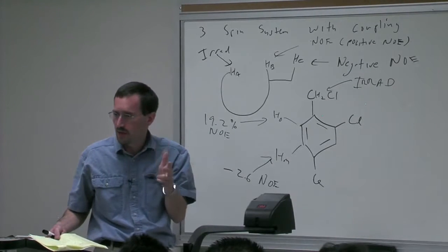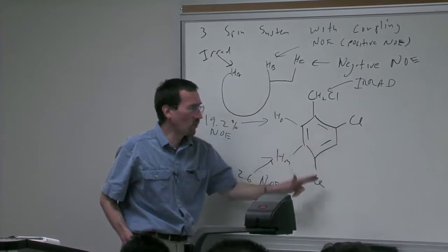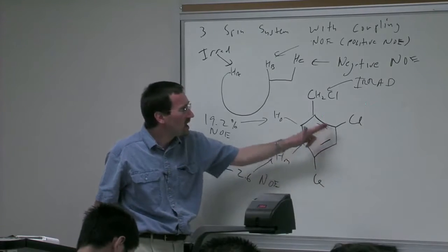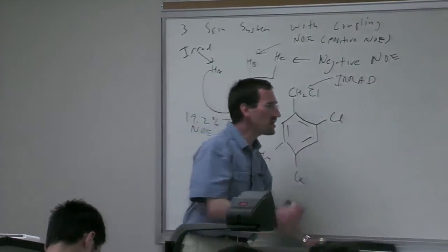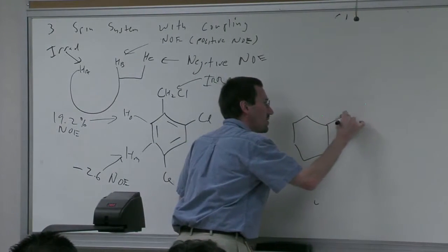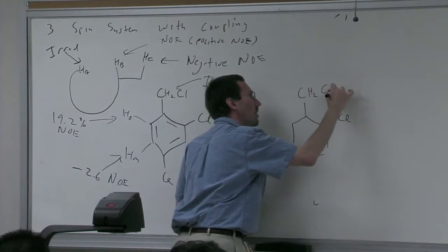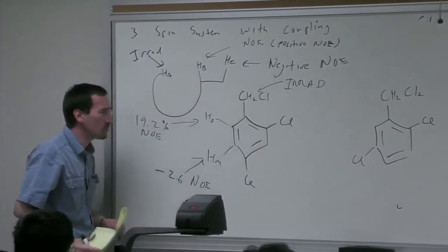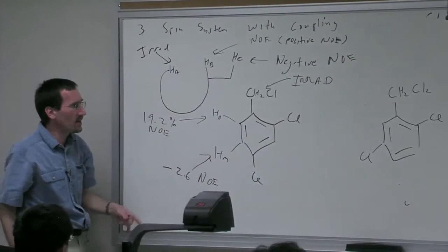most of you were able to assign your resonances and figure out among the 2,4 disubstituted isomers and the 2,5 disubstituted isomers. Here, of course, with chlorine, the effects aren't as pronounced. So just imagine in your mind's eye that you had a molecule and you were trying to tell whether it was the 2,4 or the 2,5 compound. And of course, maybe in this particular case, you wouldn't have as clear a differentiation in chemical shift.